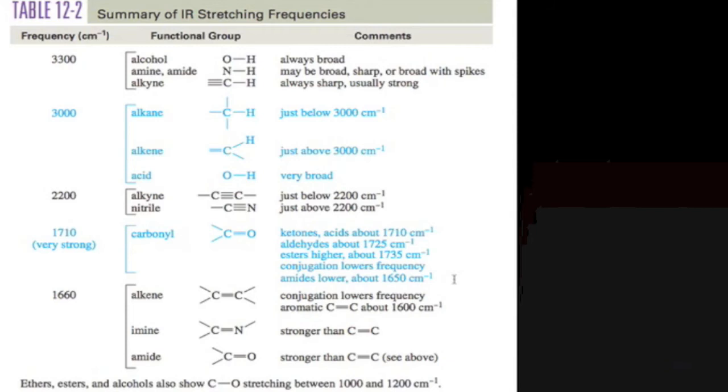Okay, so in this picture, do we have an ester or do we have an ether? Ester. Yeah. All right. So that's what I meant when I said we should go back and look at the table more carefully, because it can actually let us distinguish. It looks like you guys were trying to do ester and then you gave up on it. Maybe you were thinking you couldn't get it to work. Yeah, let's try that again.